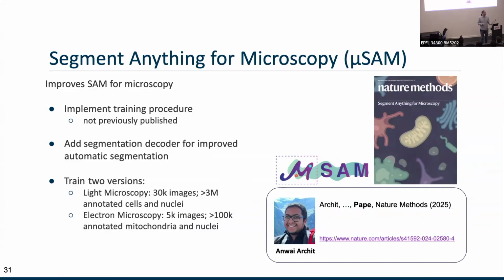If you, as I said, just want to do it for a very specific setting, let's say you have your very specific microscopy setting or any other imaging device, and you only want to have it better for this, then annotating a few images, maybe 50 or so, if you really want to get the best out of it, is enough. But then it will only get better for this specific setting, not for the whole domain. And then the training itself can be done on any standard GPU in this case.